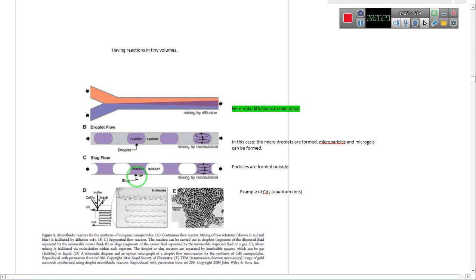But what if we don't use this multi-phase? You see that we have a multi-phase here in the science of microfluidics. When we use this strategy, they say that the multi-phase reactors have been used, but here we have the single phase.